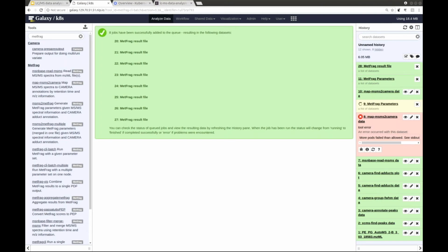Now, the Workflow4Metabolomics team in France have done an excellent job, and they already have a public Galaxy that has many of these tools installed. That would be another fantastic place if you have non-sensitive data. I'm coming from a plant institute. Our plants don't have any privacy, so we can happily upload to W4M, for example.